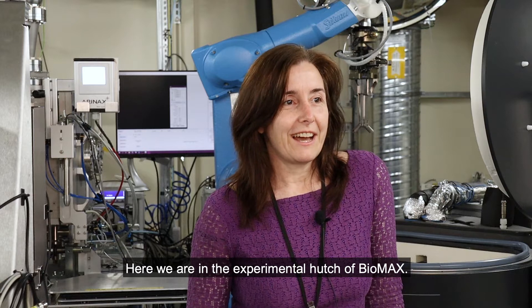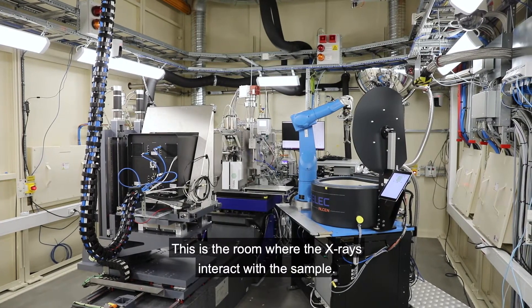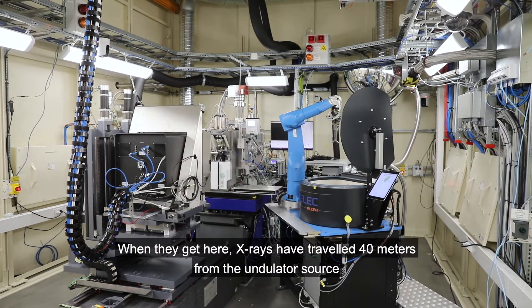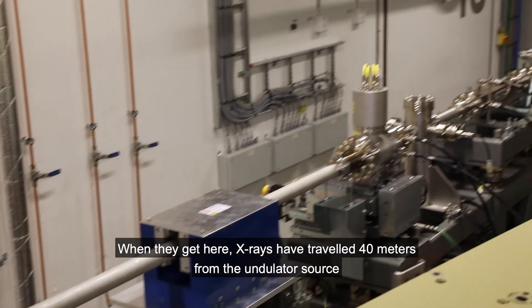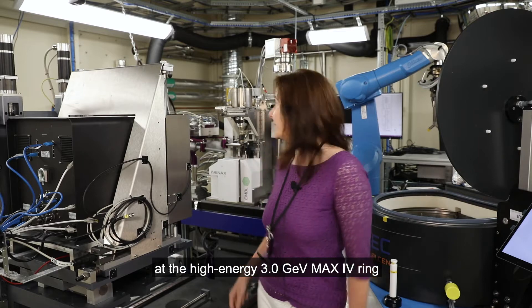Here we are in the experimental hatch of Biomax. This is the room where the X-rays interact with the sample. When they get here, the X-rays have traveled 40 meters from the undulator source at the high-energy R3 MAX IV ring behind that wall.